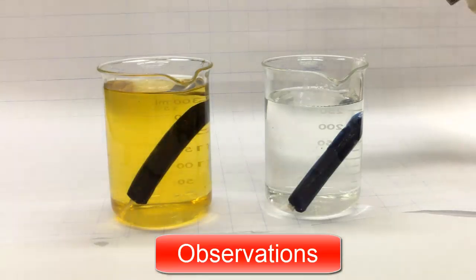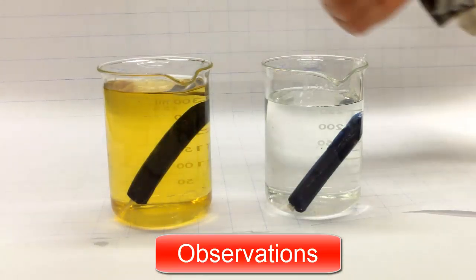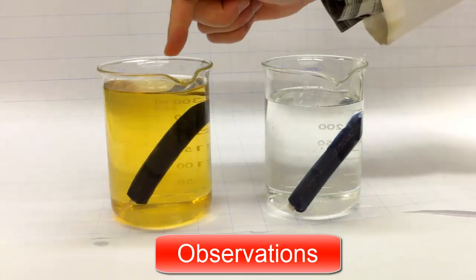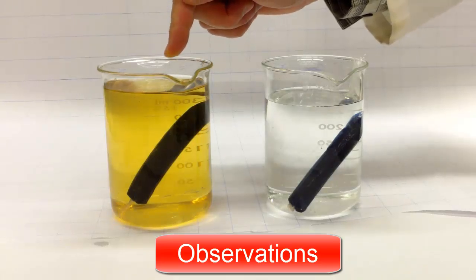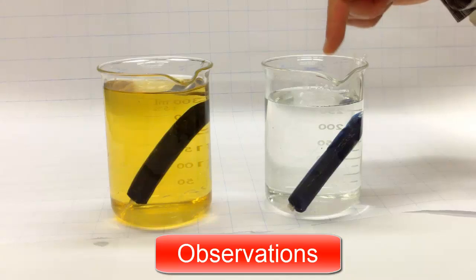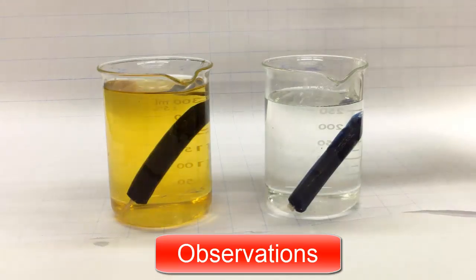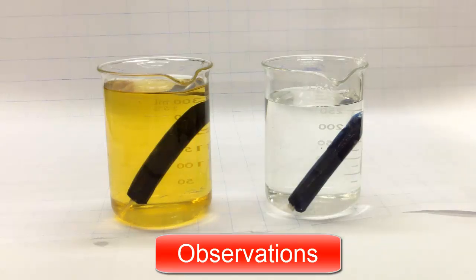So now we're ready to look at our setup. Depending on how long you've left your setup, your setup may still have some amber color outside the beaker, or all of the iodine may have diffused into the cell. Either way, we can tell which way iodine has diffused by what happened to the starch.